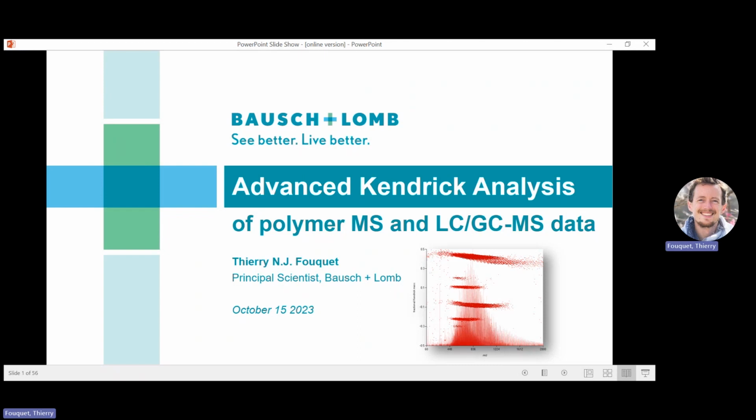So I'm trying today a third way, simply recording myself and just going over the slides I presented last August during the materials symposium organized by Waters at Pittsburgh. So during that symposium, I presented some slides about this analysis, how to build these plots and what to expect from them, what type of information we can expect and we can get from these Kendrick plots.